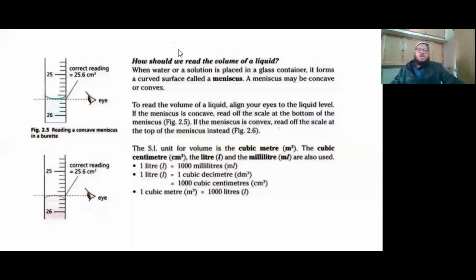Welcome back, guys. In this video I'm going to explain a very important concept, and that is the concept of reading the level of a liquid correctly. So let's get started. How do we read the volume of a liquid?